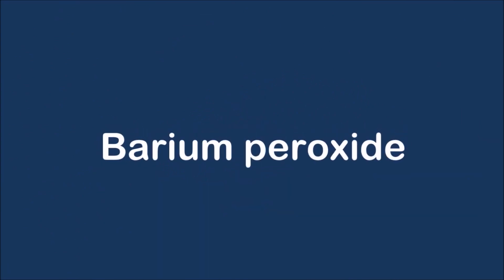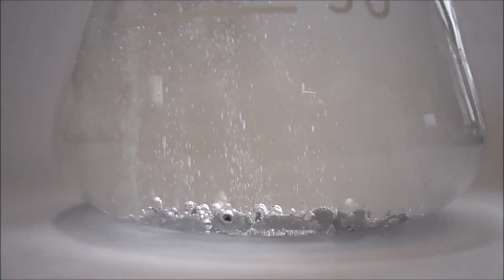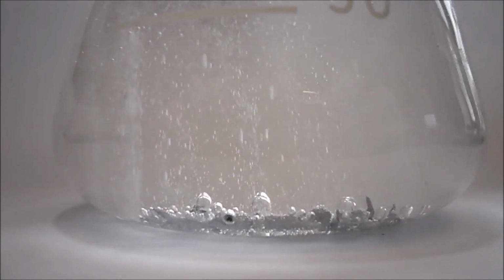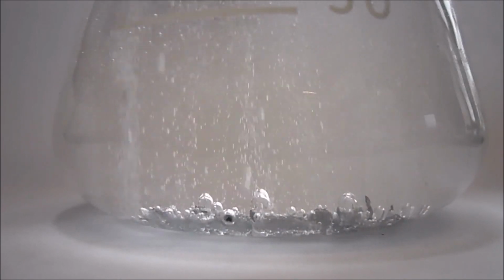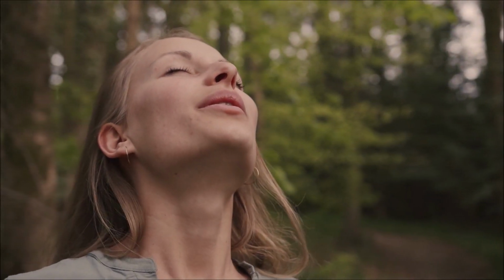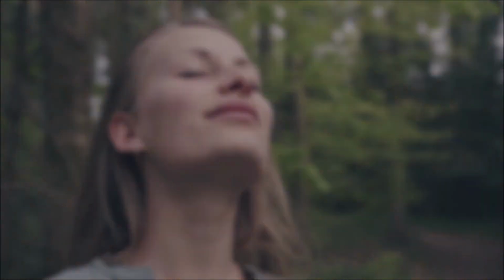We are doubly lucky with barium peroxide. Not only is it not very water soluble, therefore less toxic, it also readily donates its second oxygen atom, producing a gas that we all need to breathe and live. So let's prepare both.